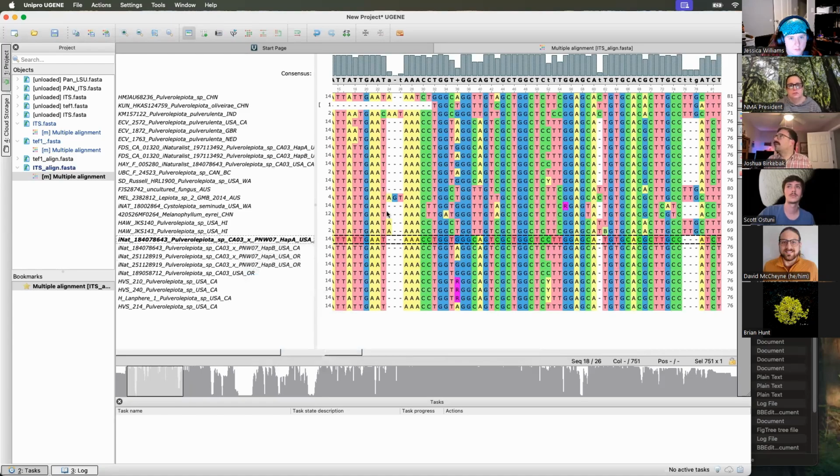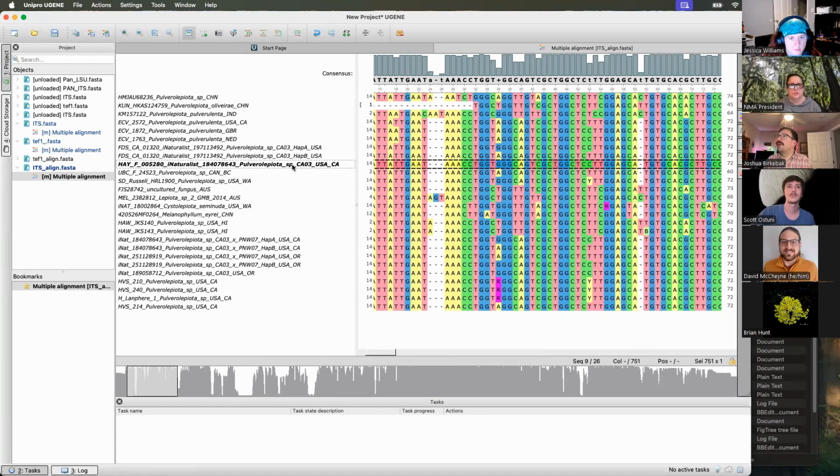We've got, see, that's our out group. We've got this one. Wait, why do I only have haplotype A and B? I'm not a consensus for this one. I might have just done something funny when I was throwing this data set together.